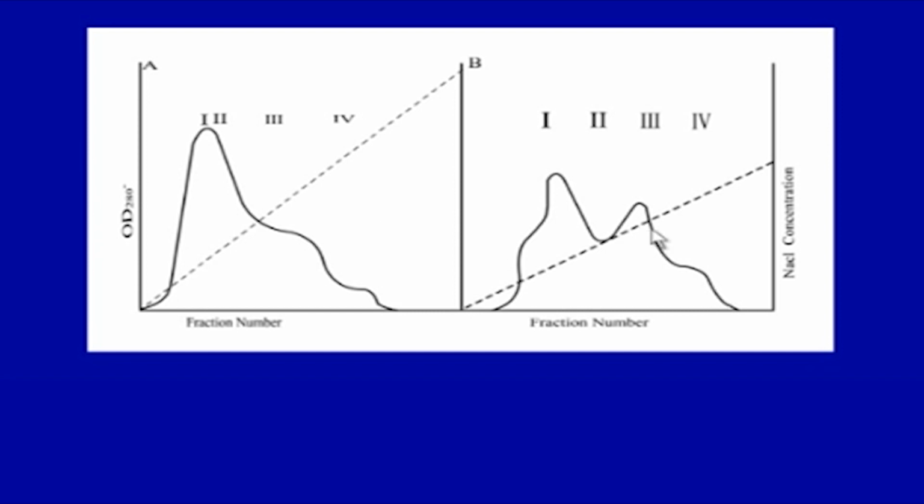Separation of 4 peaks by ion exchange chromatography is taken here, but in the steeper gradient only one peak is very clear, while in the shallower gradient peaks 2 and 3 also become clear, and the existence of the 4th peak becomes obvious. So, as you go along doing these things, general guidelines are very clear, but one has to standardize one's own conditions to get the best results.